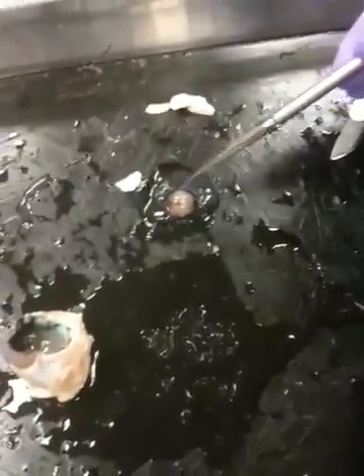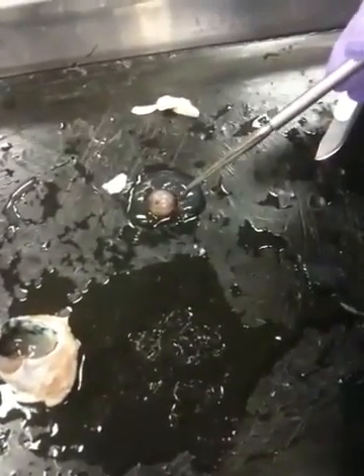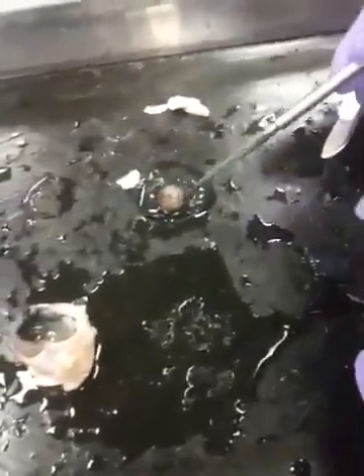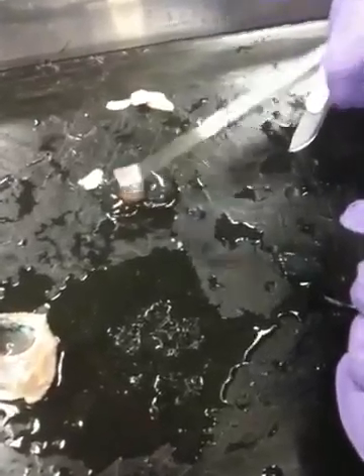Now, this is actually cool because you know how you're reading that, and we couldn't even see them on the model, that there are these little suspensory ligaments that hook the lens up to the ciliary body. This is the remnant of them. The black stuff? Yeah. So those are all the little ligaments that would hook it up, and you can see some of them have even got, and then there's probably even some of the ciliary processes attached to that. But that's all vitreous humor in there. The snot, the lens. Okay.